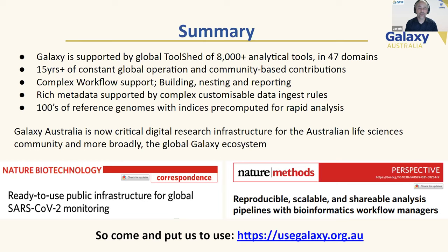And one of the subtle but important features of the service is we do actually provide hundreds of reference genomes, which have all been pre-computed at an index level to allow you to do the most rapid analysis you can. With that, I guess we'll leave you not so humbly that Galaxy Australia is a critical piece of digital research infrastructure in Australia and globally. And in many ways, that's no better showcased in two recent Nature publications within the last 2 months, both citing Galaxy Project and specifically Galaxy Australia, one for the monitoring and use of Galaxy for COVID or SARS-CoV-2 analysis, and the other one just about where Galaxy fits within the ecosystem of workflow management tools.